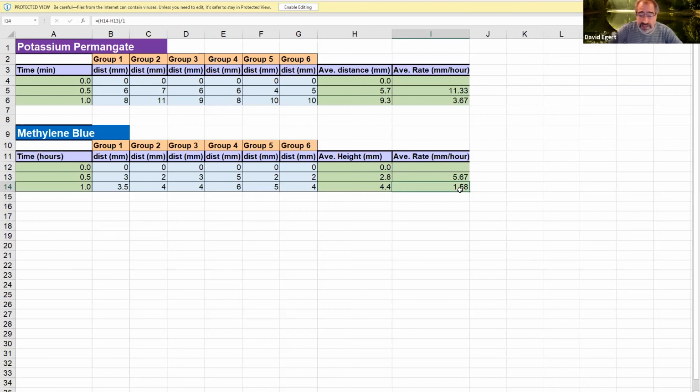And I can say, just as a reality check for you all, we have left these things overnight, over many days even. At some point, they don't even hit the end of the Petri dish. They start out kind of quick, but they slow down, and then they slow down more and more and more. So again, diffusion is good for going a short distance.